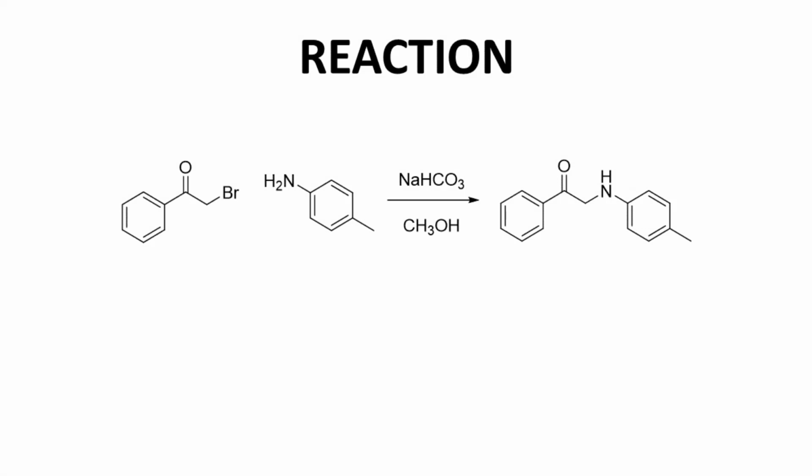Here is the reaction. I posted a video on this experiment. This reaction is nothing special. It's just an SN2 reaction between an amine, an aniline NH2 group, and a primary alkyl halide. It looks very unremarkable, so let's just skip ahead to what went wrong.